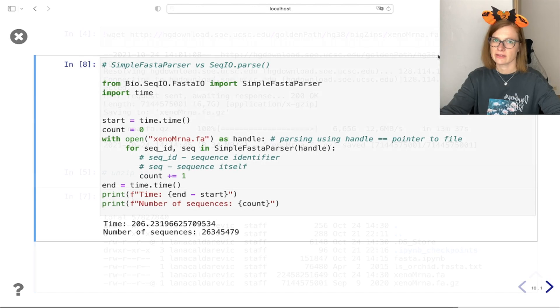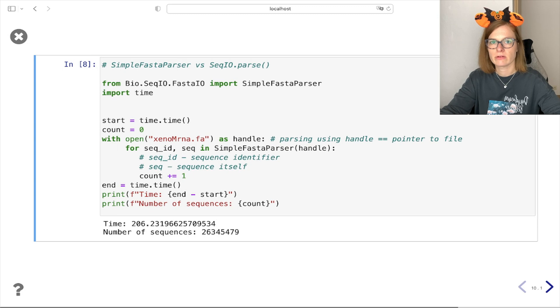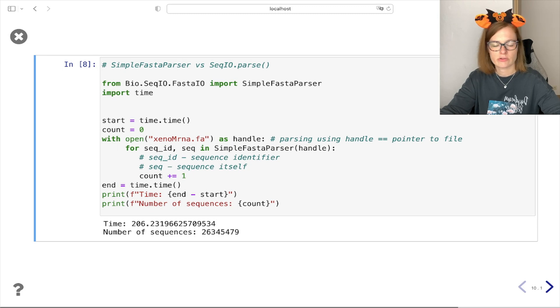In the next two examples we are going to compare the performance of SimpleFastaParser versus the parse functionality from before.